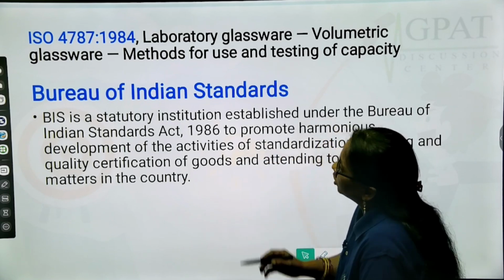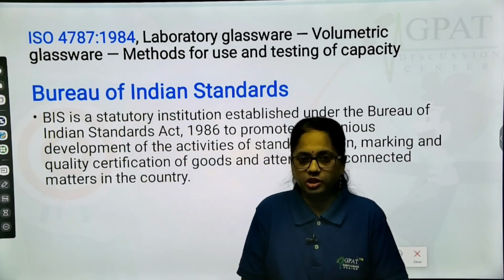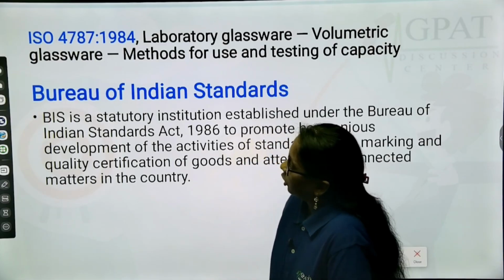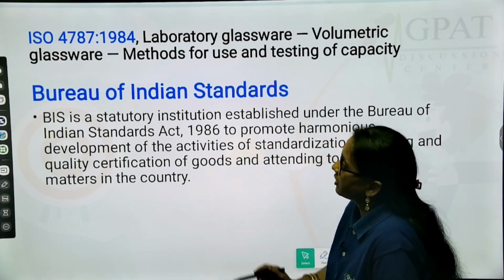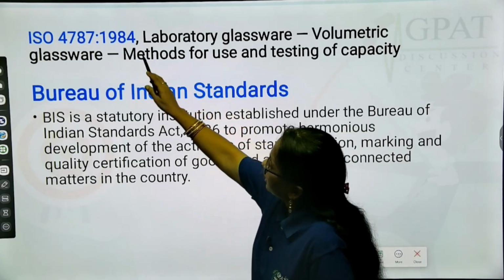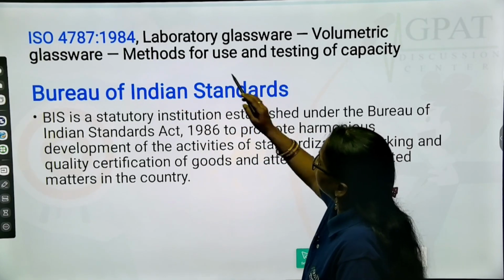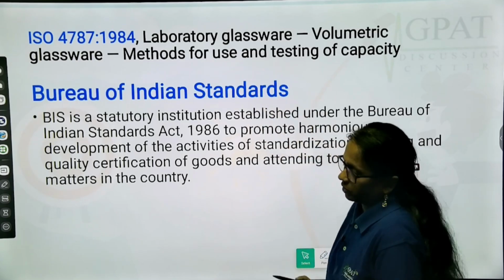Okay, so one more standard document is also there, ISO, the internationally accepted International Organization for Standardization. ISO 4787, in 1984, they have given a laboratory glassware document.